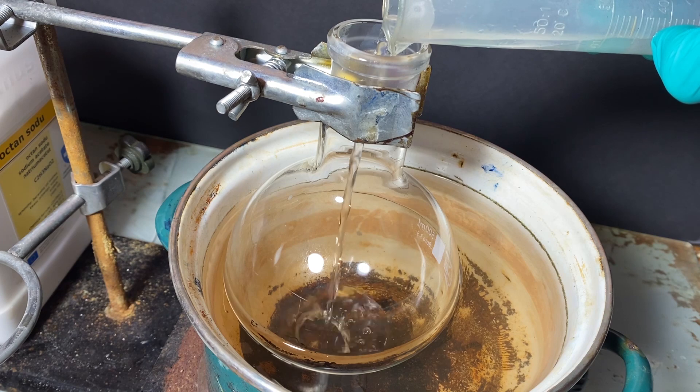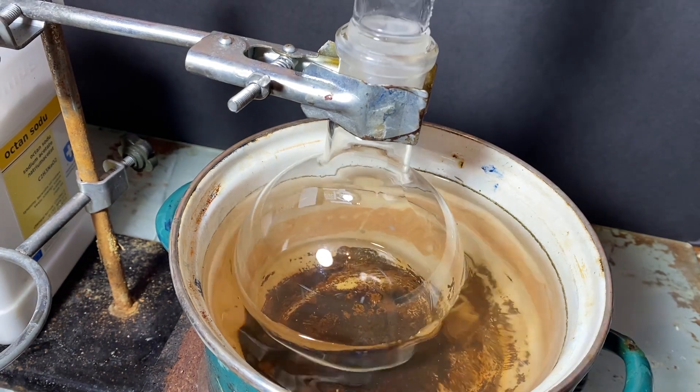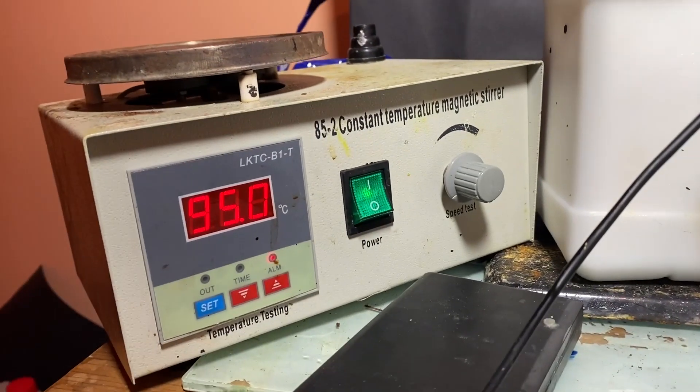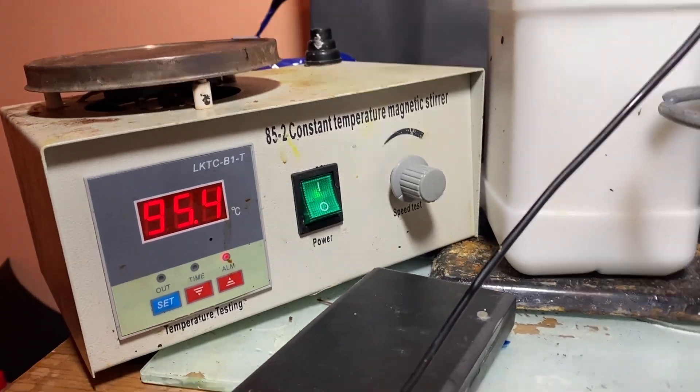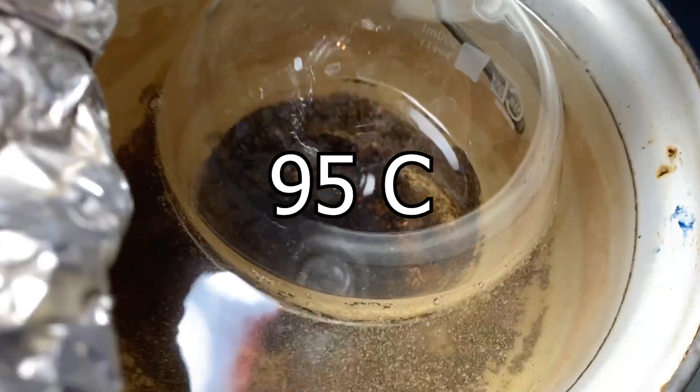Now that we've got both of the solutions, let's add them into a round-bottom flask. To complete the apparatus, I've added a condenser on top. Next, I've turned up the heat and waited until the water bath started boiling. The ideal temperature for this reaction is 95°C, and a boiling water bath does it just fine.